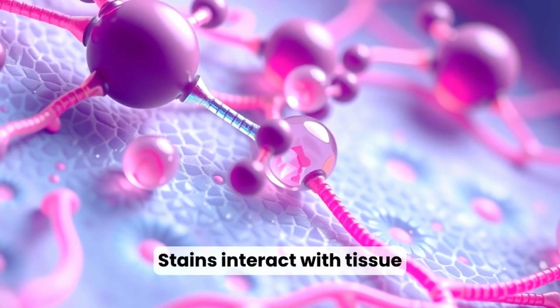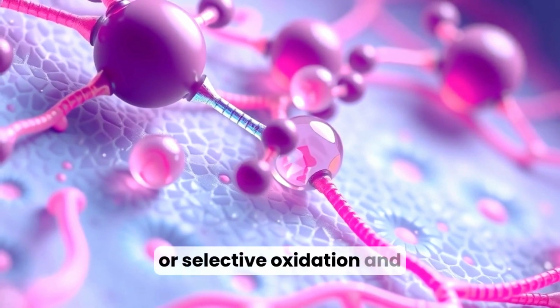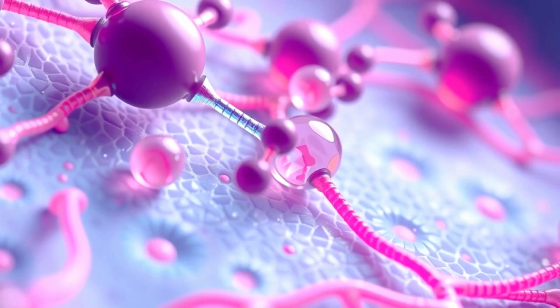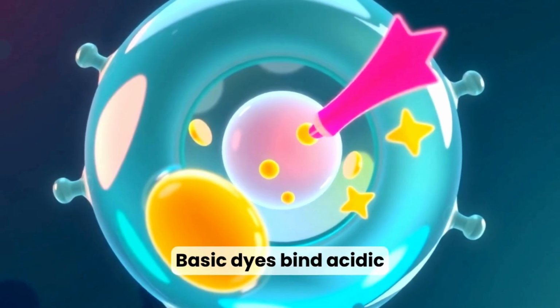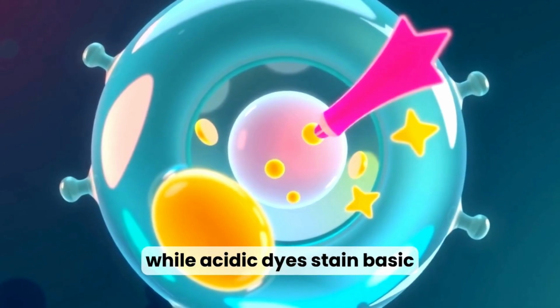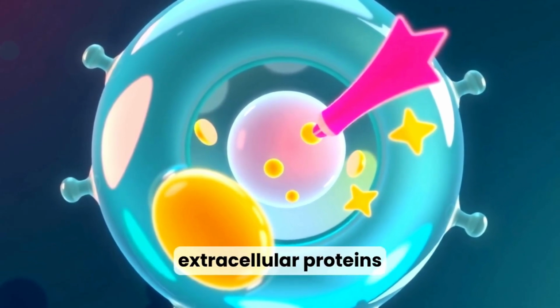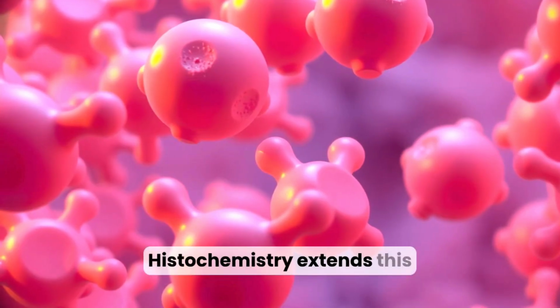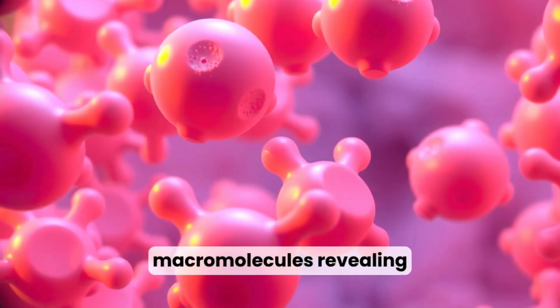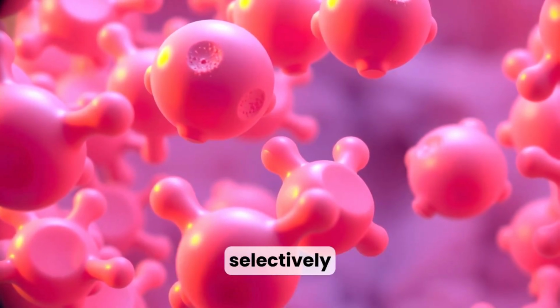Stains interact with tissue components through chemical affinity, charge interactions, or selective oxidation and reduction reactions to provide diagnostic contrast. Basic dyes bind acidic structures such as nuclei, while acidic dyes stain basic components like cytoplasm and extracellular proteins. Histochemistry extends this idea by targeting specific chemical groups or macromolecules, revealing carbohydrates, connective tissue, or microorganisms selectively.